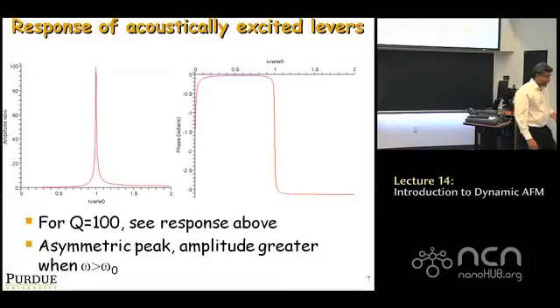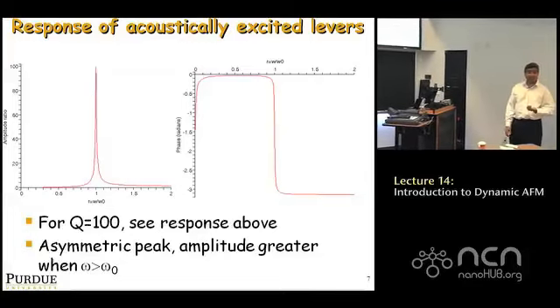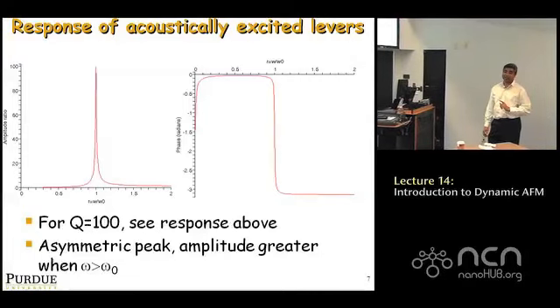Good point. In fact, in yet older systems, even the phase you will not get in degrees, but it's in volts. So that becomes a problem. You have to convert it to degrees, so you've got to work with the company to figure that out. It really annoys me when I see phase in volts and amplitudes in volts. I hope you've already realized that.